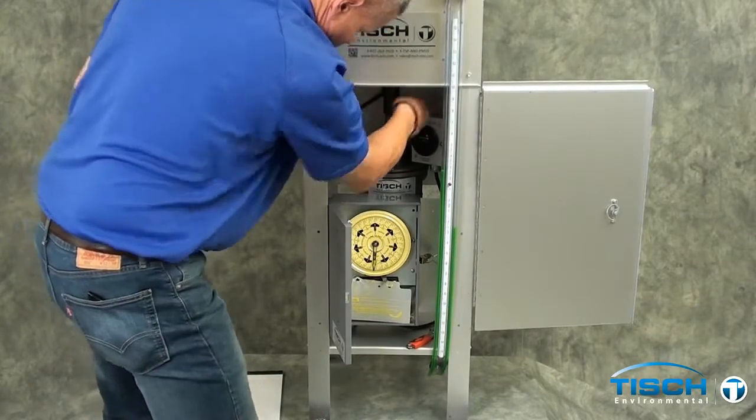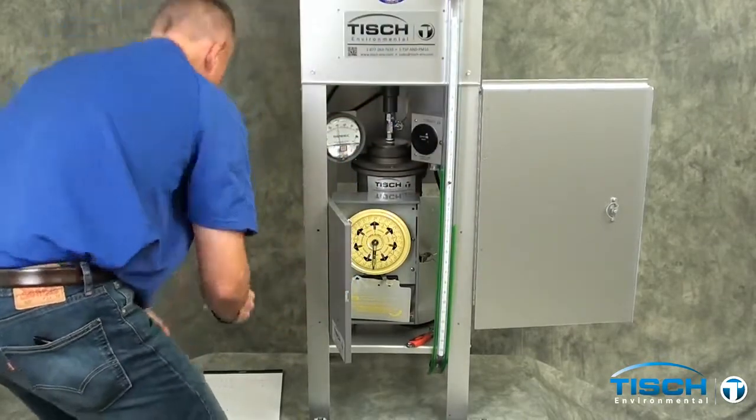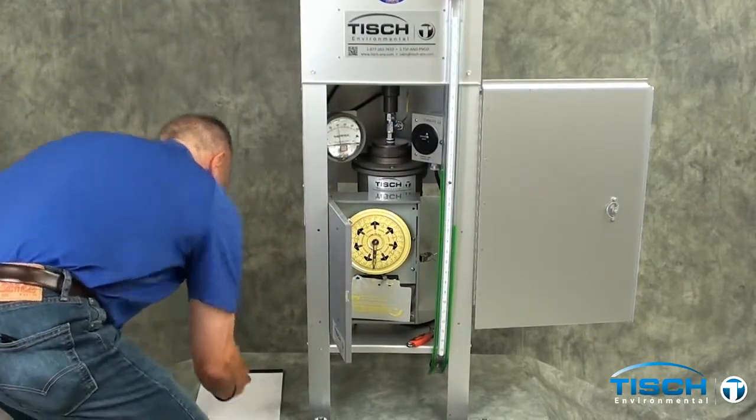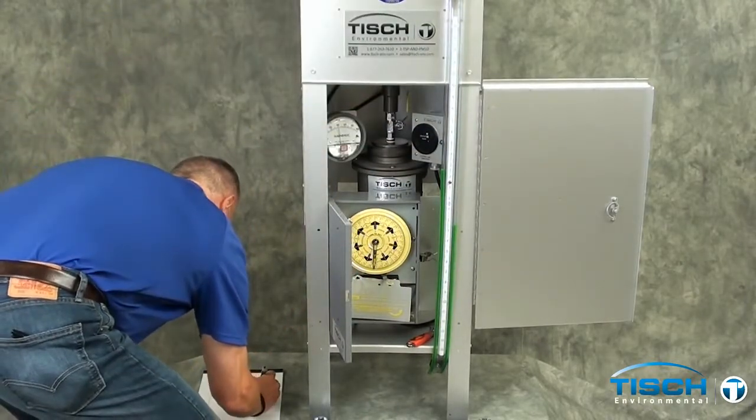Again, move the ball valve away from you to obtain a reading of 40 on the magne-helic gauge. This time the manometer went up 2.6 and down 2.5 inches for a total of 5.1 inches.